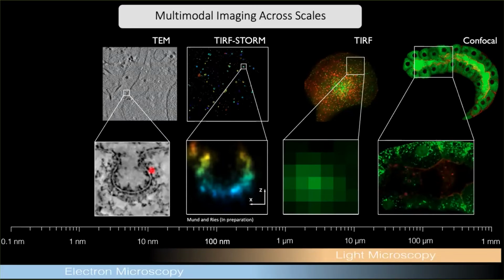So for example, by transmission electron microscopy, we can get already the shape of the membrane and the coat. So I would say this is a more comprehensive view of the object, while in fluorescence microscopy, we can only see what we have labeled. In electron microscopy, we also see what is not labeled. So that's an additional advantage going along this trajectory.